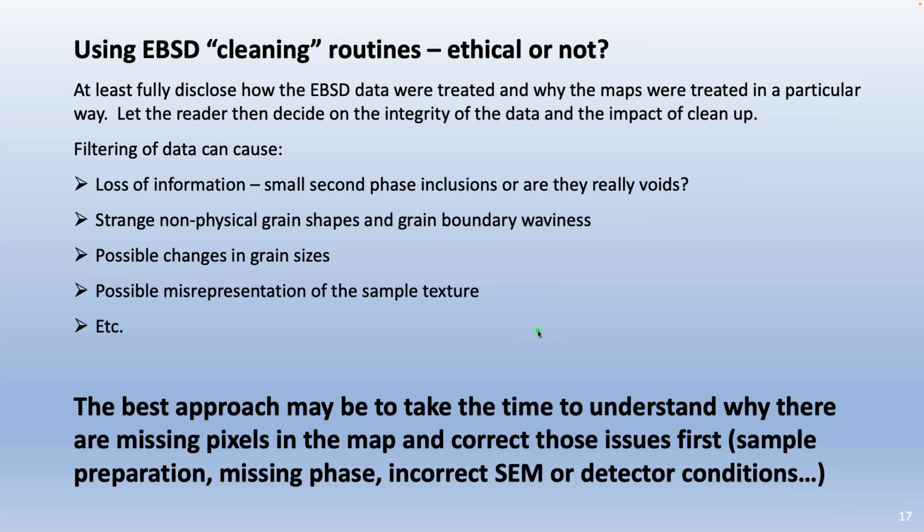So again, to leave you with this, I think the most important thing is just to disclose what you did to the EBSD data and let the reader make their decision, or the journal editor, or your professor, or your customer, whoever. Let them make the decision that what you did was reasonable and ethical.